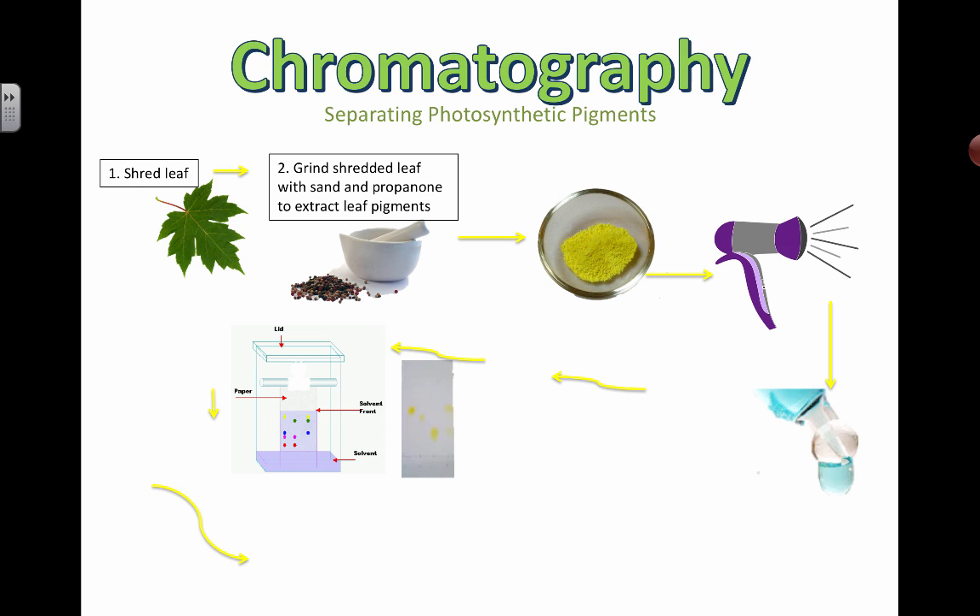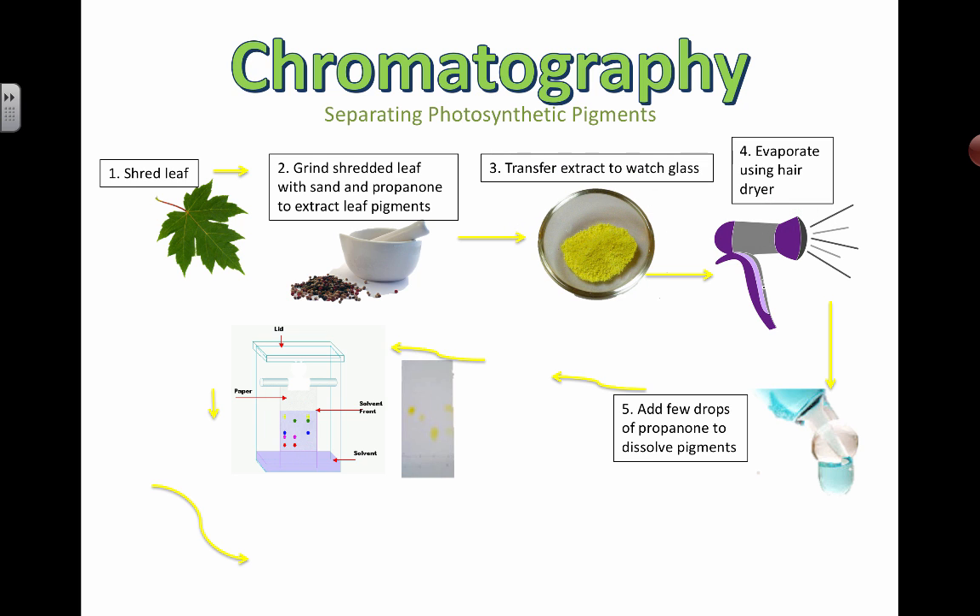You have to keep track of the type of solvent you're using and even the concentration of the solvent, because it can affect how far these particular pigments get dissolved and therefore how far the dots are going to move when we calculate a little bit later. You're going to transfer the extract to a watch glass and evaporate off any extra liquid. What you're really trying to do is concentrate as much of this pigment as possible, then add a few more drops of fresh propanone to dissolve the pigments.